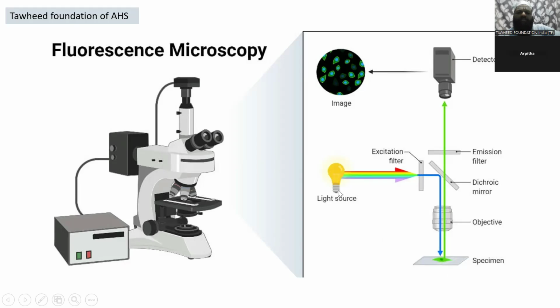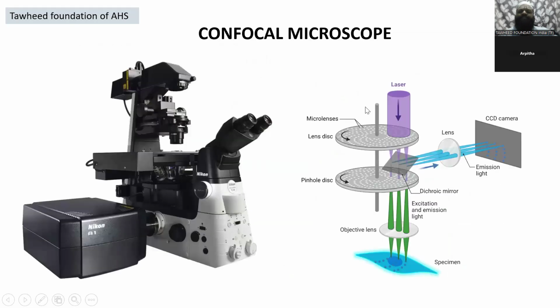And with the help of the UV light source, the excitation filter and emission filter emit the organism's light, and the organism's images can be observed with a fluorescent color. That is usually with the help of staining. When you apply a fluorescent stain, the cells appear fluorescent against the dark background.